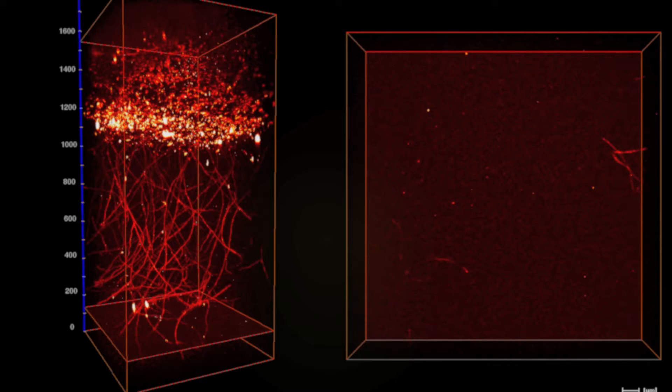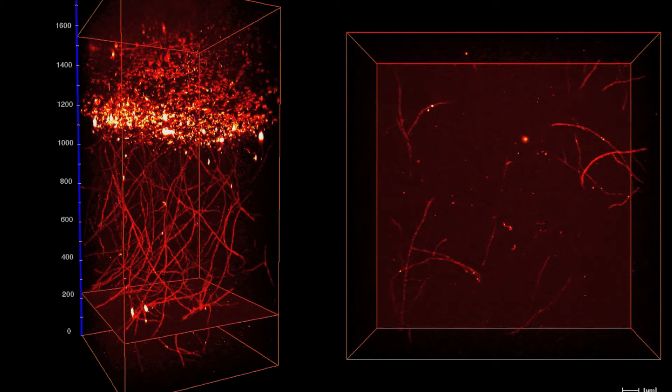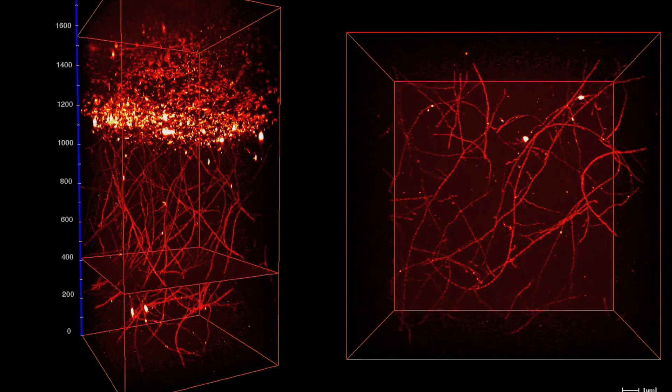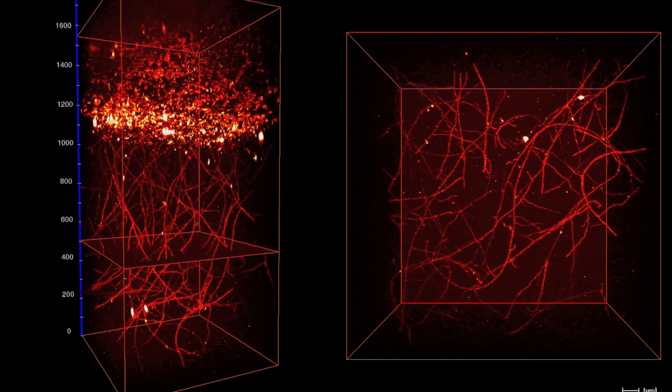To reconstruct a 3D image by 2-photon fluorescence microscopy, the consecutive micrographs are stacked. In this image, the 1-micron sections were stacked up to approximately 1600 microns.